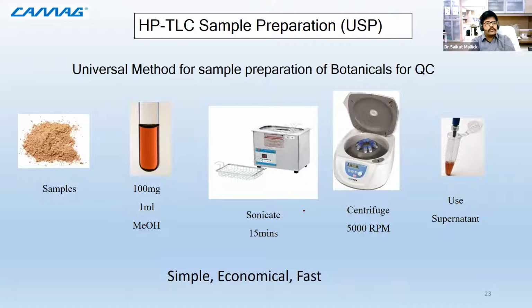And that is why a simple method for sample preparation in methanol has been used. Now, if you're going for bioautography studies, especially antimicrobial, here is an important aspect: methanol by itself is cytotoxic. So if you prepare a sample in methanol, the component which comes out may have an antimicrobial activity by default because of the methanol. Also, the plate has to be dried after the development so that the solvent components are removed.